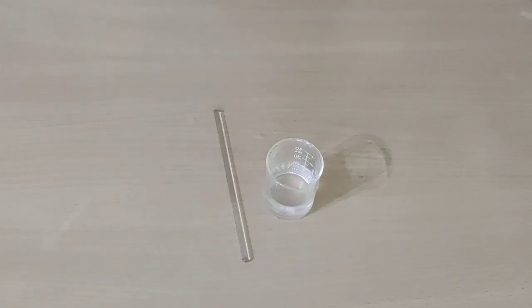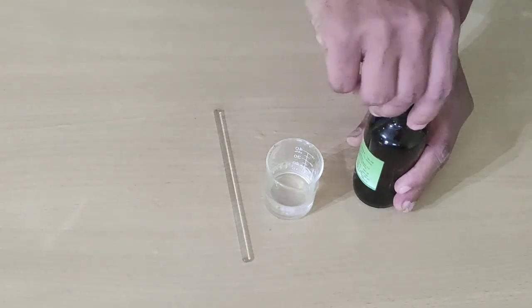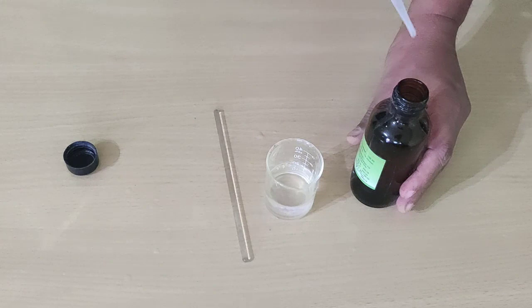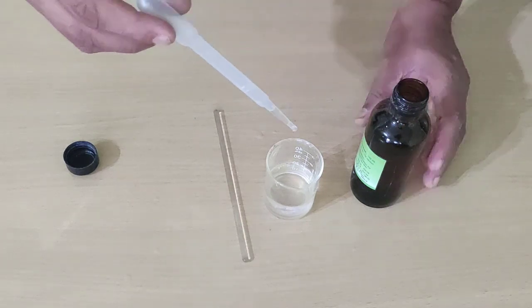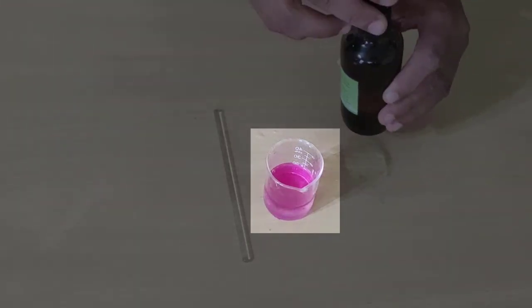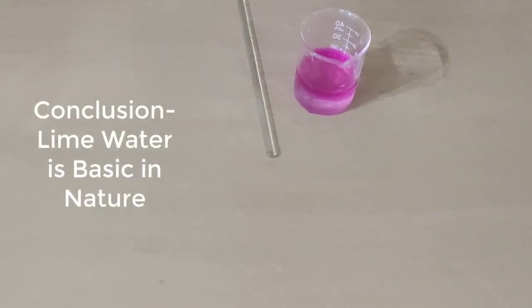Now in this lime water, we will add a few drops of phenolphthalein, which is an indicator, with a dropper. See, it has turned its color and phenolphthalein has turned pink in lime water. Lime water is basic in nature.